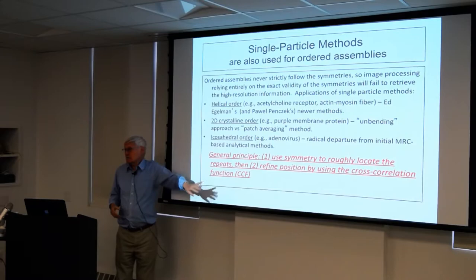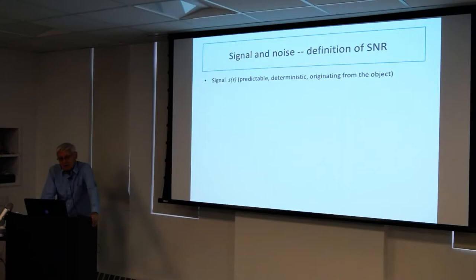Okay, so now I'm going through a number of concepts that are very useful to know. The problem that we have now in Cryo-EM is that there are these black boxes of programs that don't tell you what is actually going on, and it's difficult to visualize what kind of problems are being solved inside.